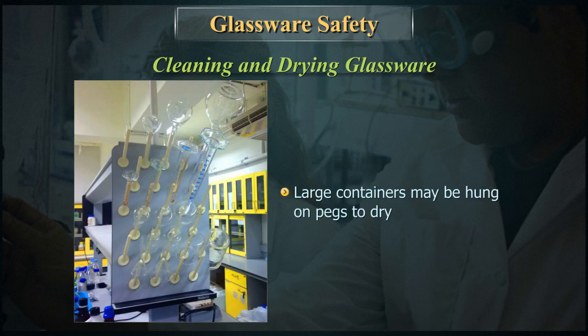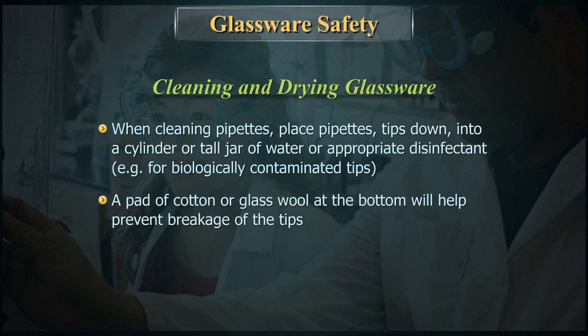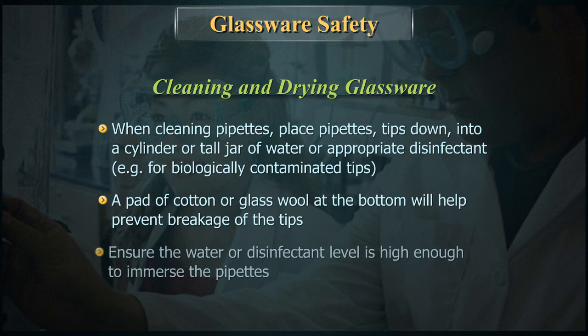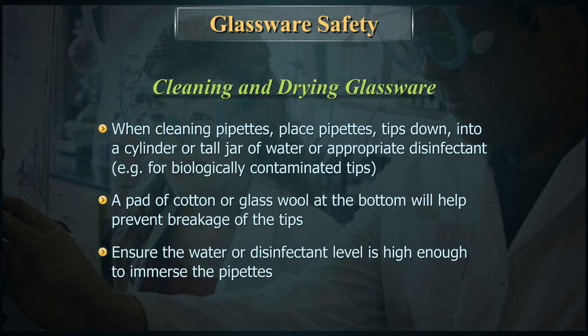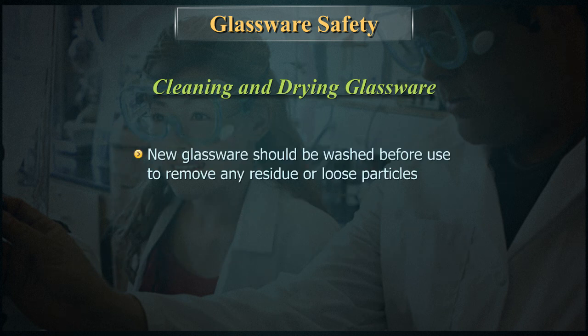Large containers may be hung on pegs to dry. When cleaning pipettes, place them tips-down into a cylinder or tall jar of water or appropriate disinfectant — for example, for biologically contaminated tips. A pad of cotton or glass wool at the bottom will help prevent breakage of the tips. Ensure the water or disinfectant level is high enough to immerse the pipettes. New glassware should be washed before use to remove any residue or loose particles.